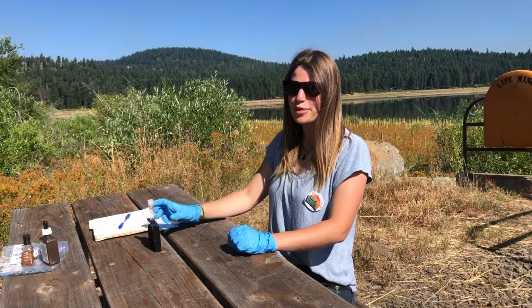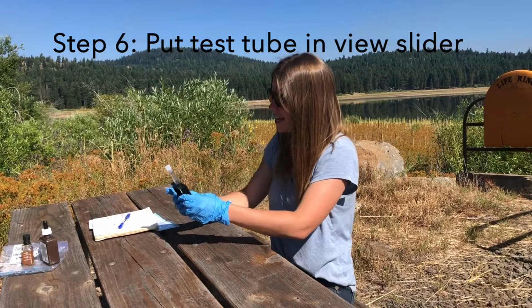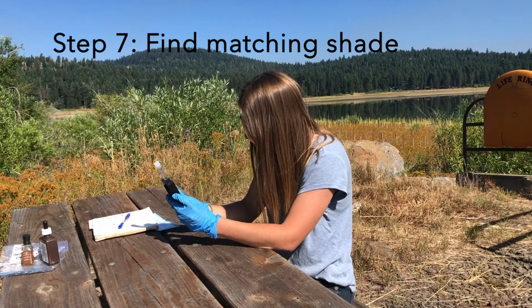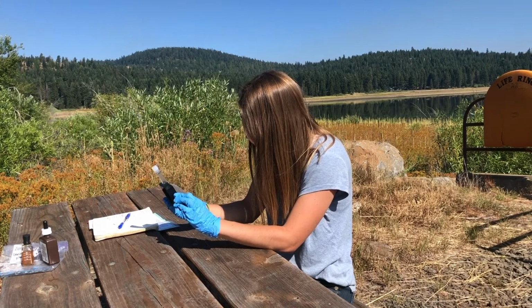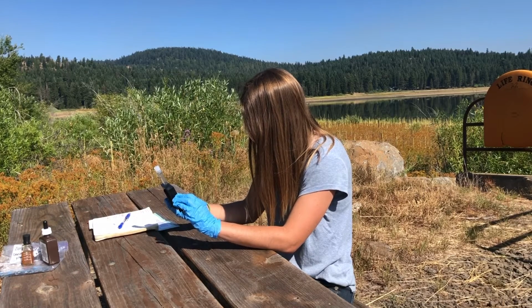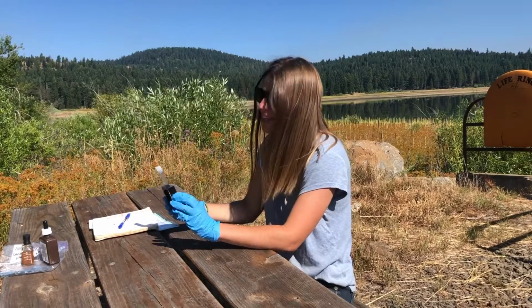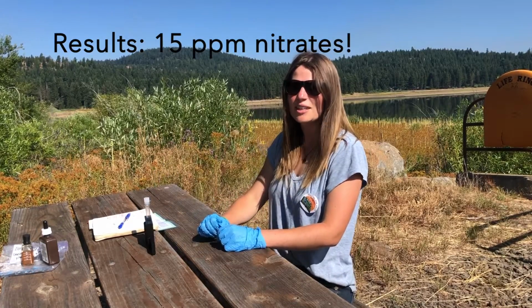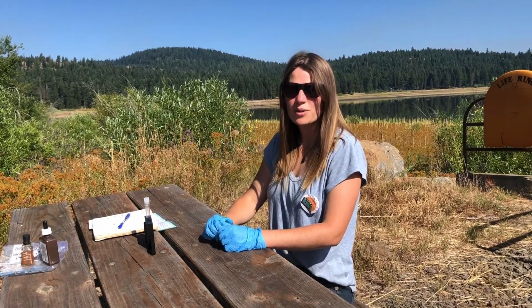All right, it's been 3 minutes. Now it's time to put it in our AquaView slide and try to find the shade that matches. So it looks like it matches the shade. That means it is 15 parts per million nitrates. Now go to your data sheet and write down those results. 15 parts per million nitrates, and then read about nitrates and where they come from.